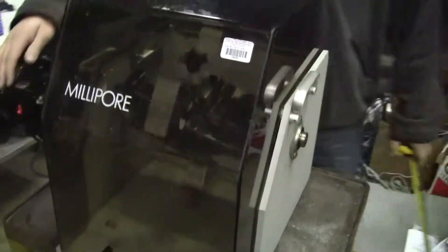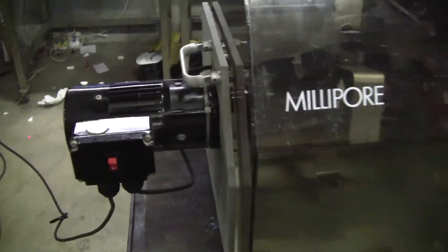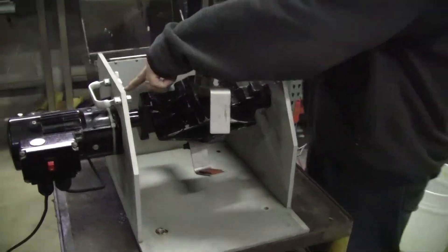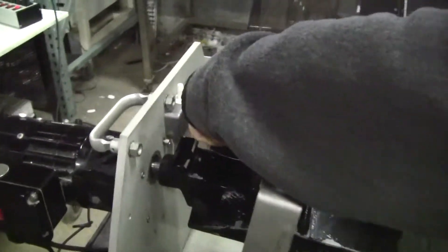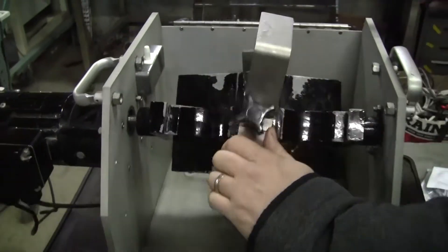We have a simple on-off switch in the front. It is not a variable speed motor. We've got a safety switch here — when the hatch is open it will stop. I'll spin this through.